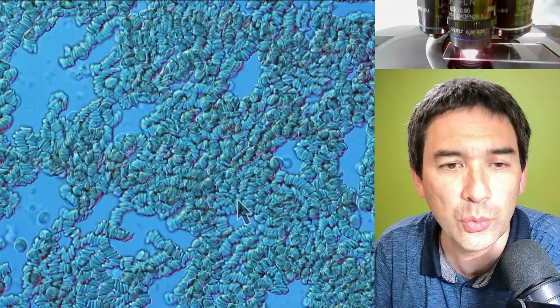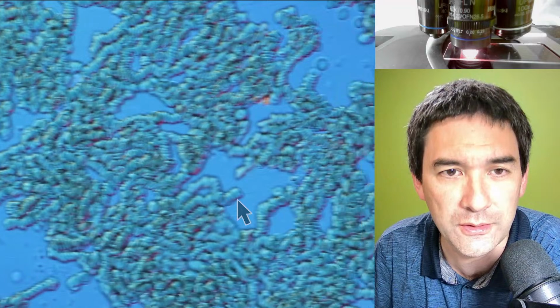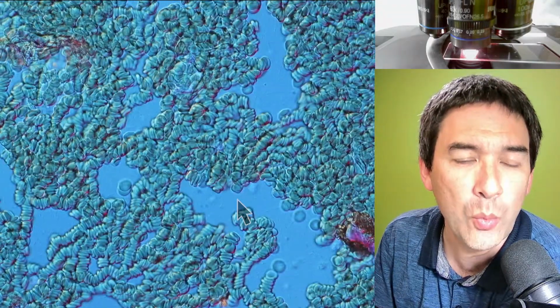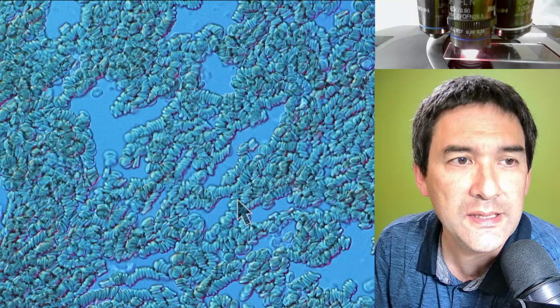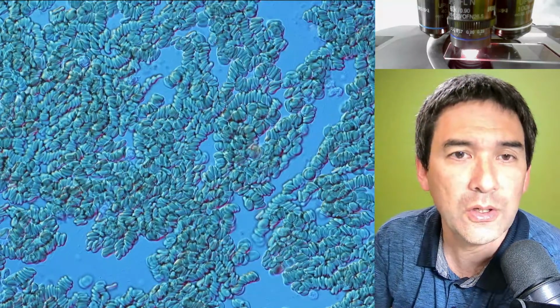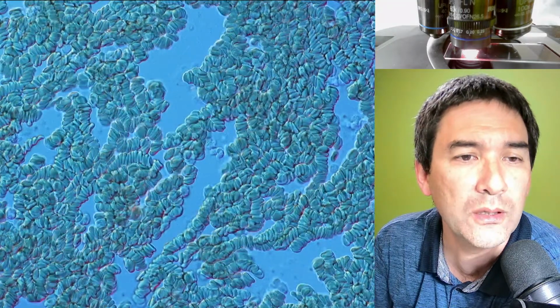And I'm going to also show you a video in time lapse. Now, if you are very, very patient, and this is possible, but it does require a lot of patience, you might be occasionally able to see also some white blood cells. Sometimes they move around as well. Let me turn off the arrow. Because they are sometimes difficult to see, and because sometimes they move slowly, I've made a time-lapse video of this as well.